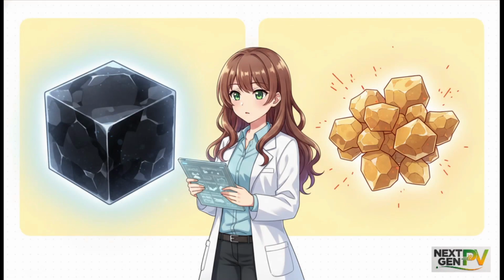Moving to Section 2, identifying phases and impurities, the first glance. Now that we've got Bragg's law in our toolkit, we can apply it to real films. The first and most vital step is identifying what actually formed on your substrate. Let's say you fabricate a perovskite film. You obviously want that desirable black perovskite phase. By comparing your XRD pattern to a known reference, you look for those characteristic reflections.